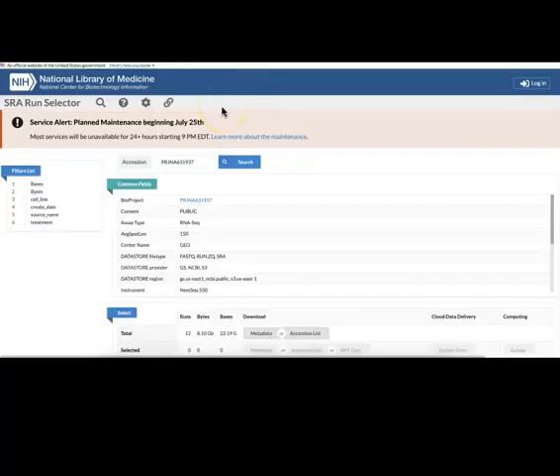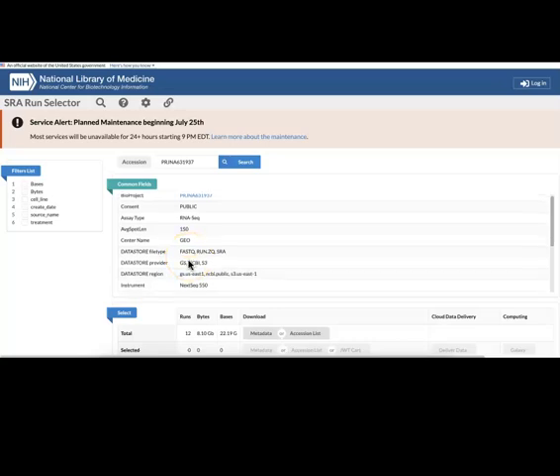So here is information about this particular BioProject. If you're interested in gaining more information about the research description itself, you can click onto this link. But let's look at that first box, the common field. So again, this is the RNA-seq data set that we're going to be looking at. We're interested in the FASTQ, which is the file type that is stored for this data set.